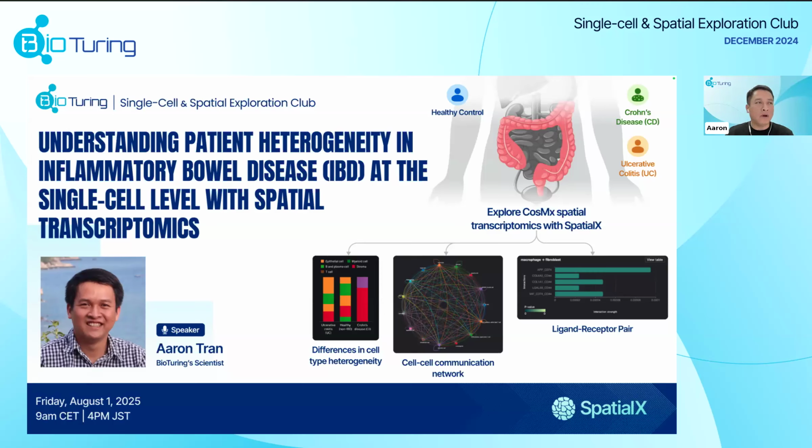And today I will show you the application of SpatialX in studying different human diseases. Today I'm going to focus on inflammatory bowel disease, or IBD, at the single cell level, and we're going to use single cell transcriptomic data.